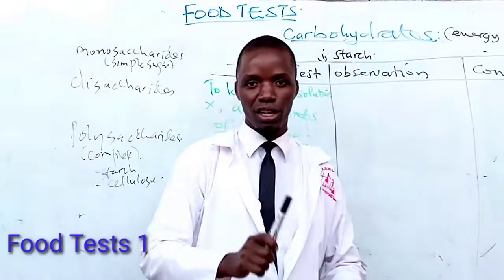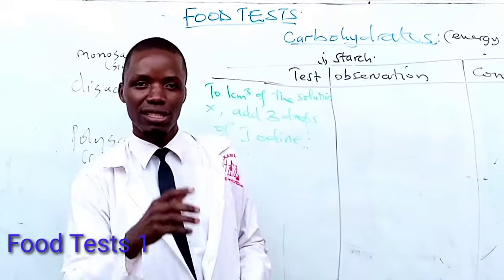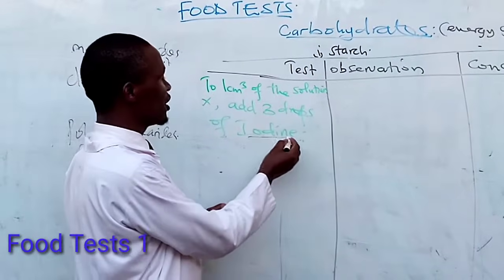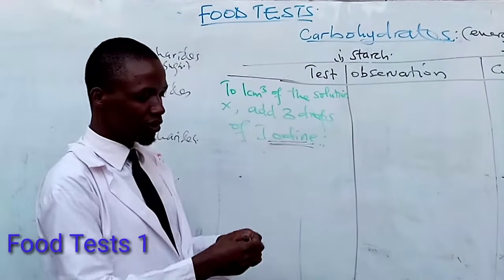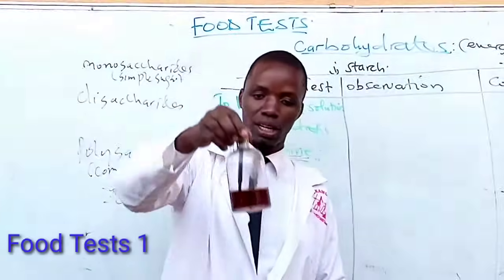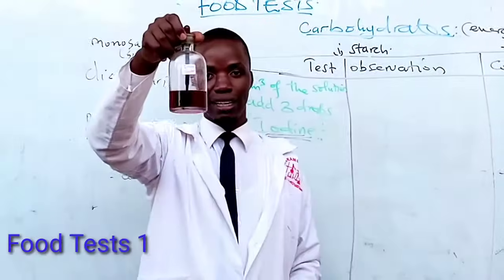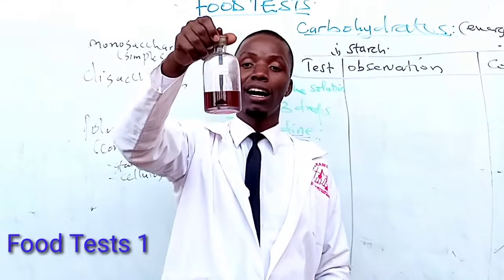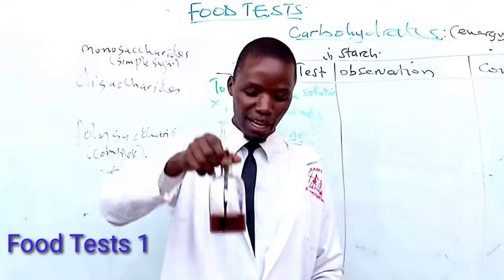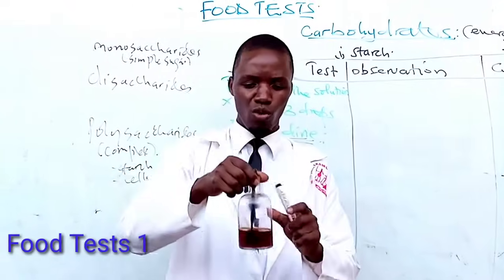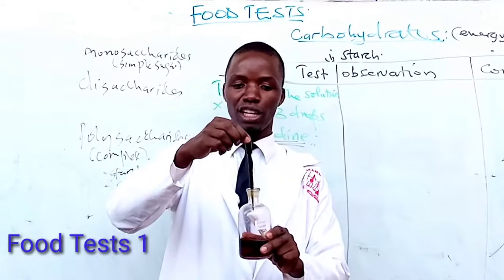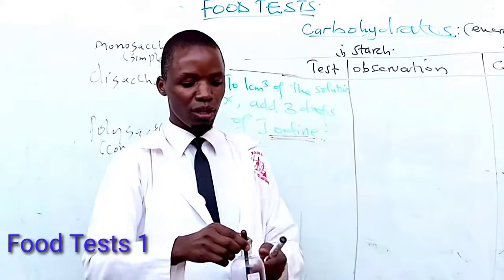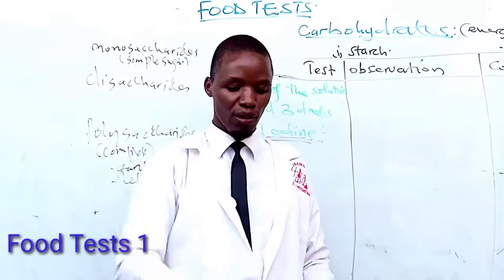In the laboratory, the reagent we use for testing starch is iodine. As you can see on my table, iodine is brown in color. This is the reagent we use for testing for starch. We use drops — that's why you can see the dropper on my bottle. We use the dropper to pick drops from the iodine solution to use in our test.